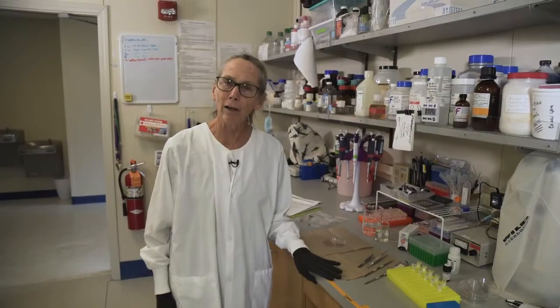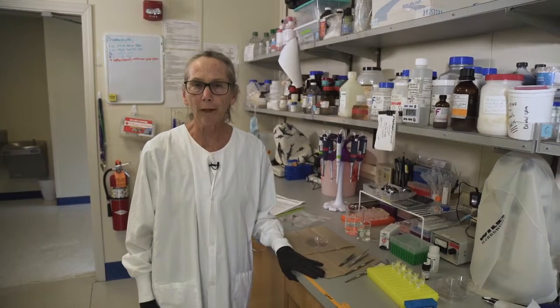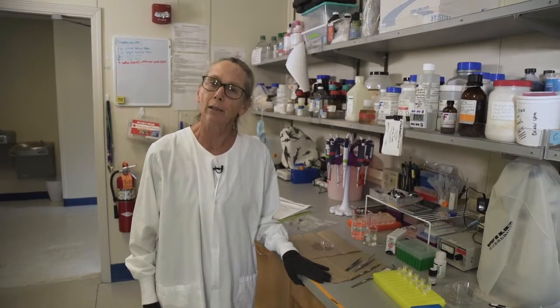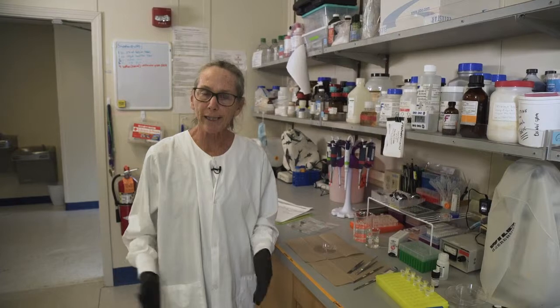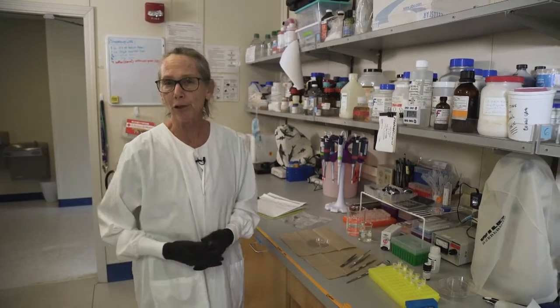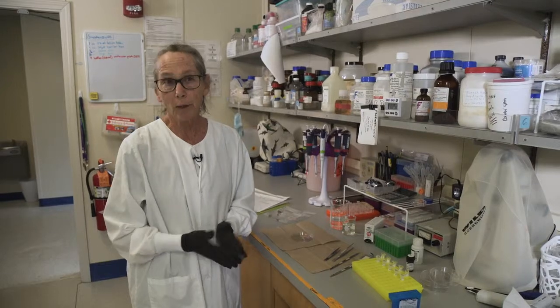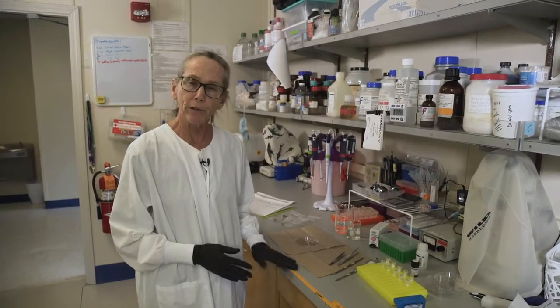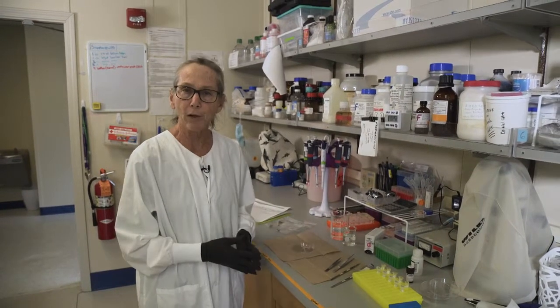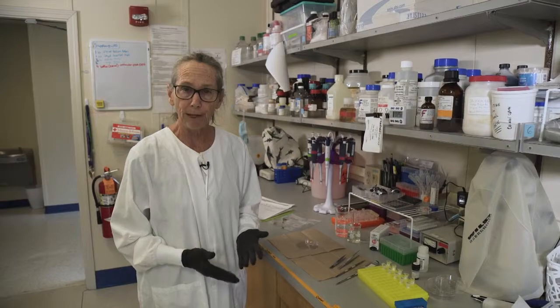Aloha, my name is Kay Howe. I work at the Jarby lab. I've been working on rat lungworms since 2011 with Dr. Jarby. Some of my studies have included looking at infection in slugs and snails, and also looking at what happens when slugs and snails drown in water. Today I'm going to show you how we start the process of looking at a slug or snail to see if it's infected.